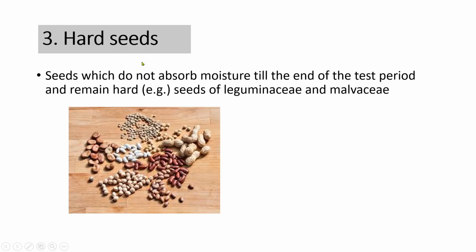Coming to another category of seedlings, which is hard seed, ungerminated: the incapability of seed germination due to hard seeds. Okay, in the case of hard seeds, examples to be cited are vegetable pulses, or vegetable legumes.